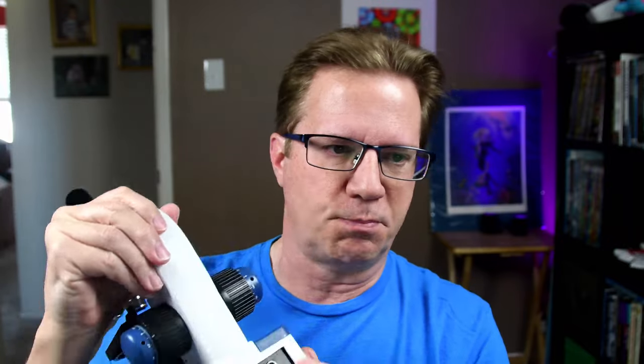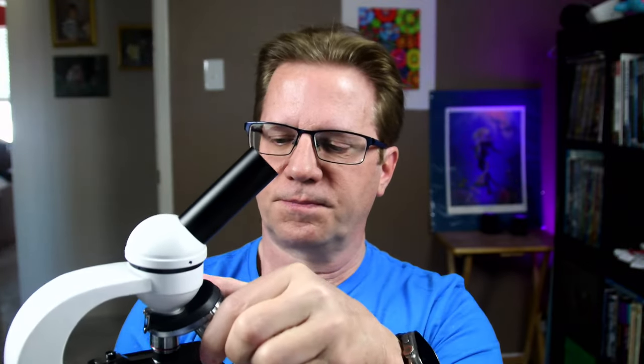This one will be fine for in-home use. It has a port on the back for electricity, comes with a power supply, and you can plug it in — or use the battery compartment, which is USB. One thing I liked is that you cannot bring the base up so high that the lens breaks the cover slide, which always happened before — you'd be focusing trying to figure out what it is and you'd hear a crack. This one doesn't seem to do that.